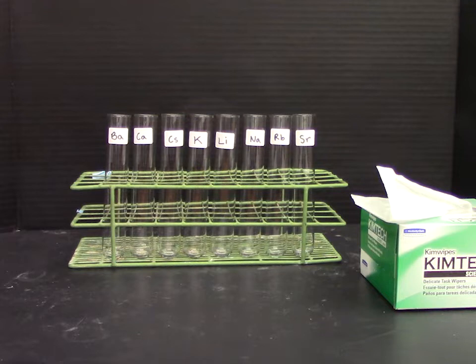Therefore, when we're making the standards, we don't need to measure anything out. For the video, we're using much larger test tubes than you'll be using for the lab. This is so that it's easier for you to see. Make sure to label all of your standards before starting so you don't mix up the test tubes.